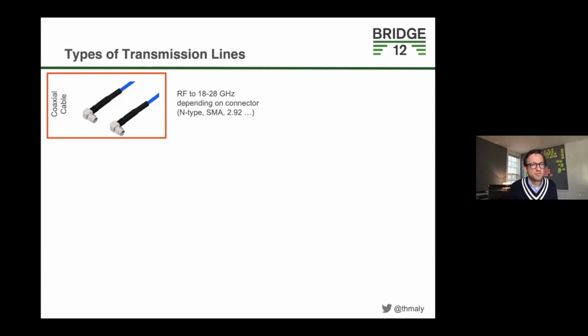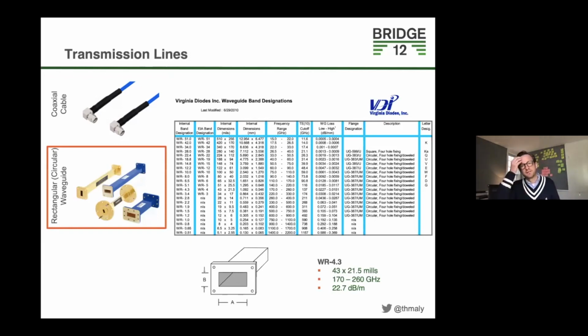If you go to higher frequencies, you're going to wander into waveguide area. So the most common waveguides are typically rectangular waveguides. If you do pulse EPR spectroscopy, that's a clunky thing, whereas in CW your resonator is mounted on it, but the losses in the waveguide are so low that often at the low frequencies, waveguide is still the way to go. If you're going for sensitivity and low losses, there's nothing that's going to beat a waveguide. Sometimes you go to SMA cables, but that's more a convenience aspect rather than sensitivity.